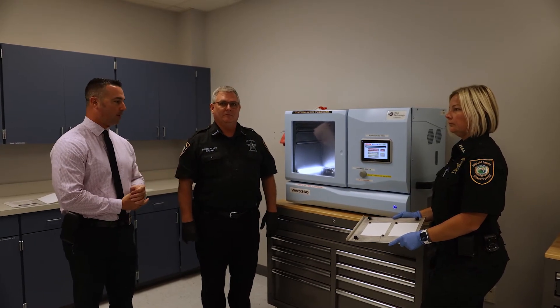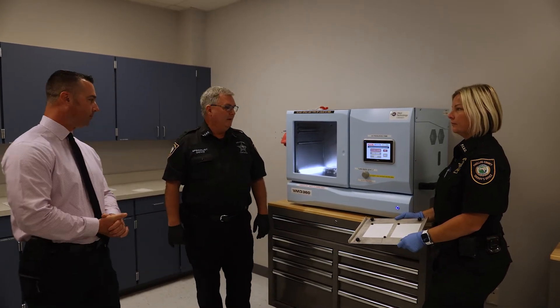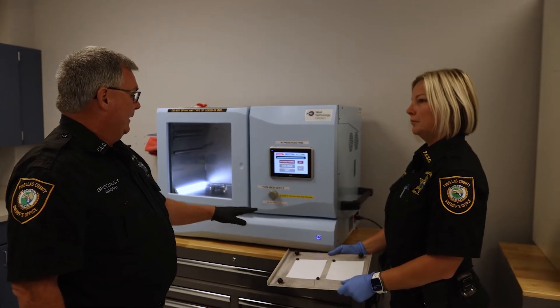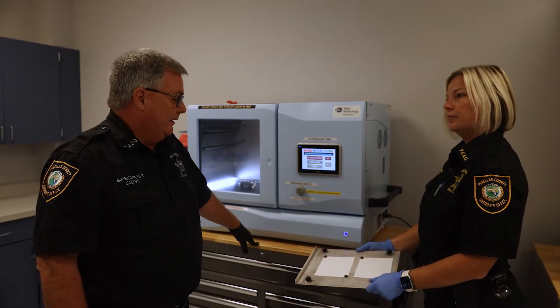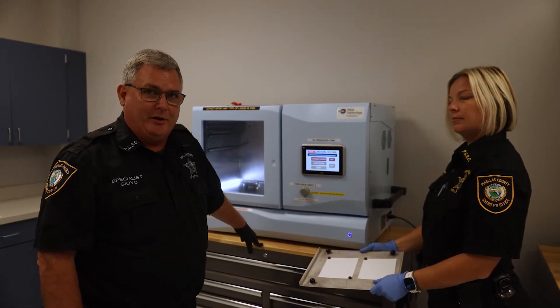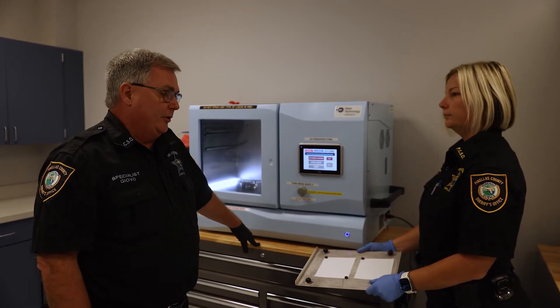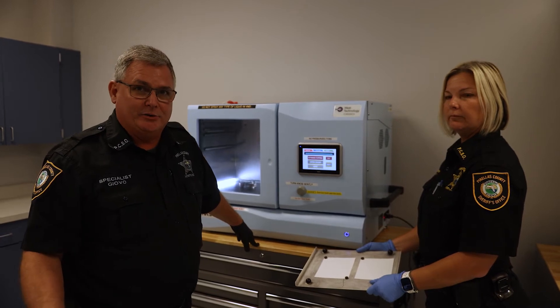I'm going to turn it over to Craig — he's going to give you a little bit of a tutorial with Assistant Supervisor Klein. So the VMD, the vacuum metal deposition chamber, is a process that we use for processing latent prints on different surfaces. It could be a hard surface, a material type like shoes, a metal surface like a gun, or a plastic surface like a money tray.